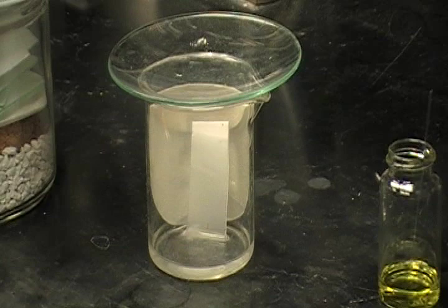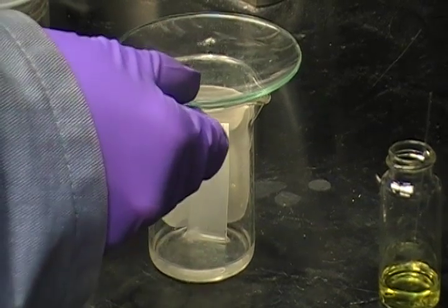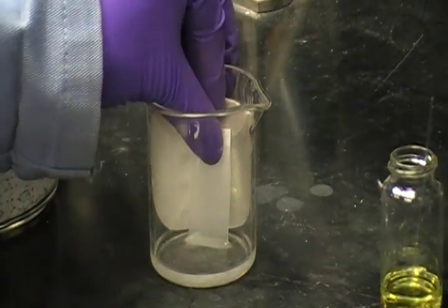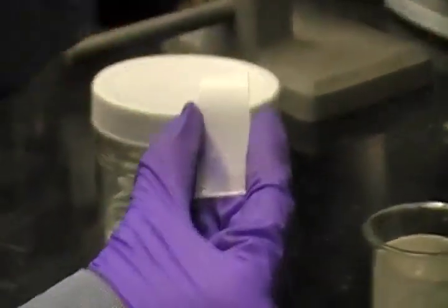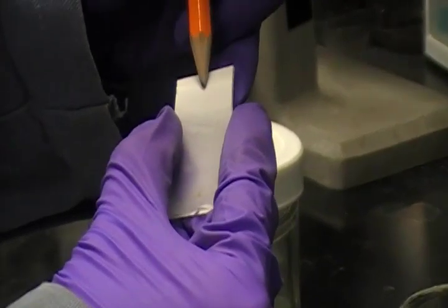Always keep track of the progress of the TLC plate to make sure that the solvent doesn't run off the plate. We must remove the TLC plate from the jar before it wets the whole plate and carefully mark the solvent front with a pencil.